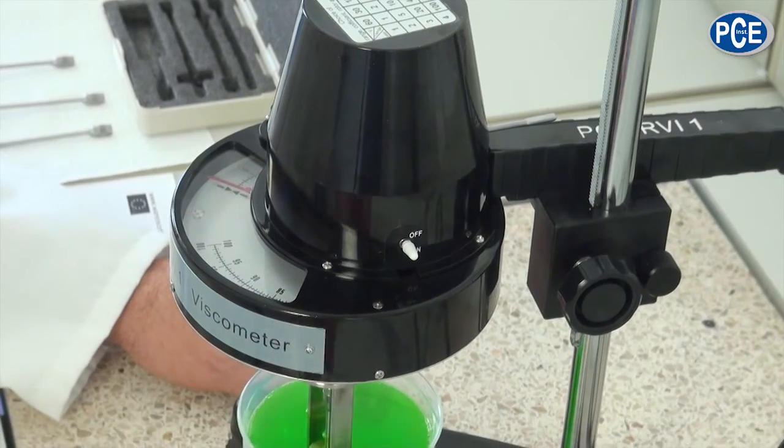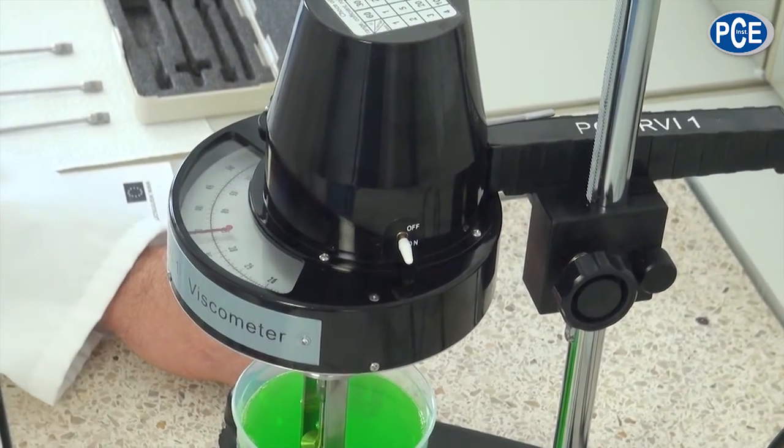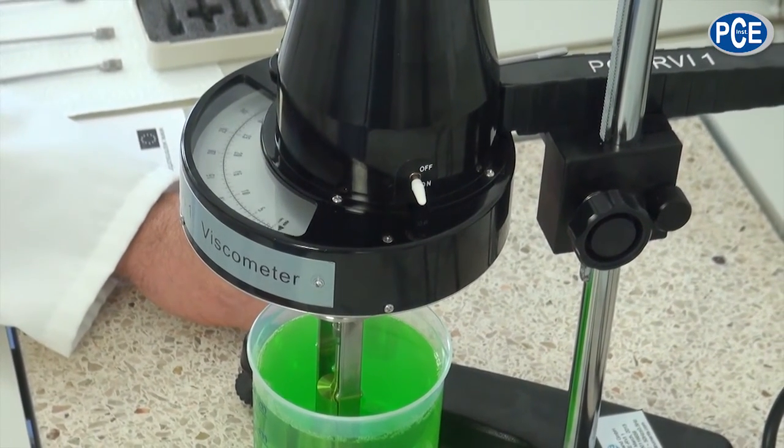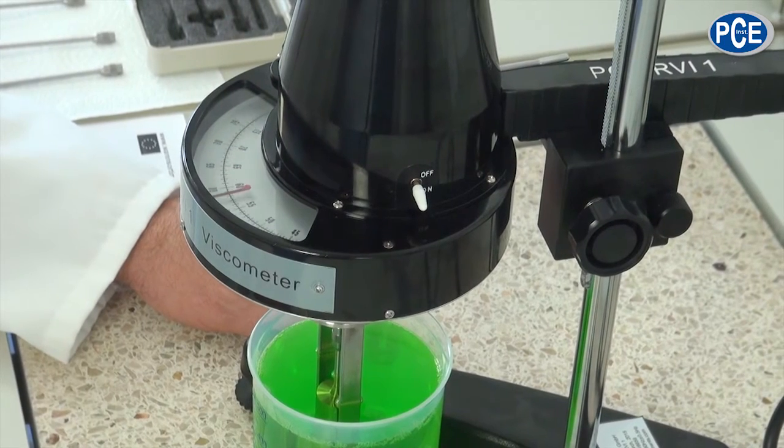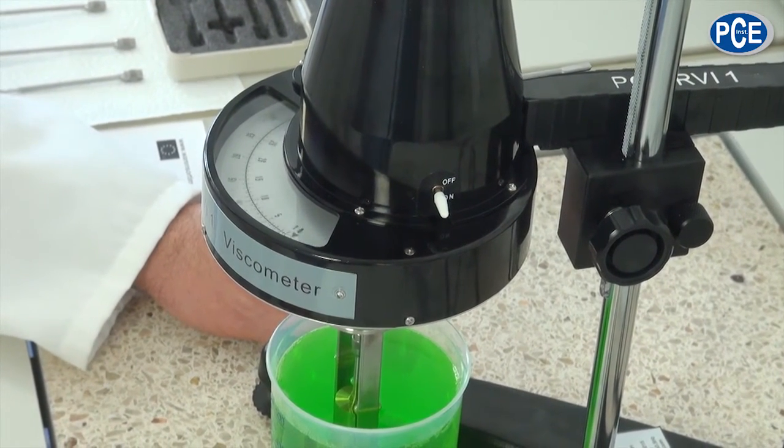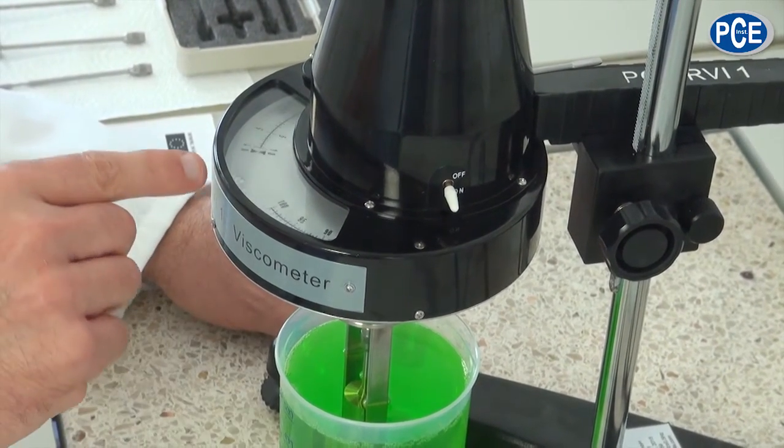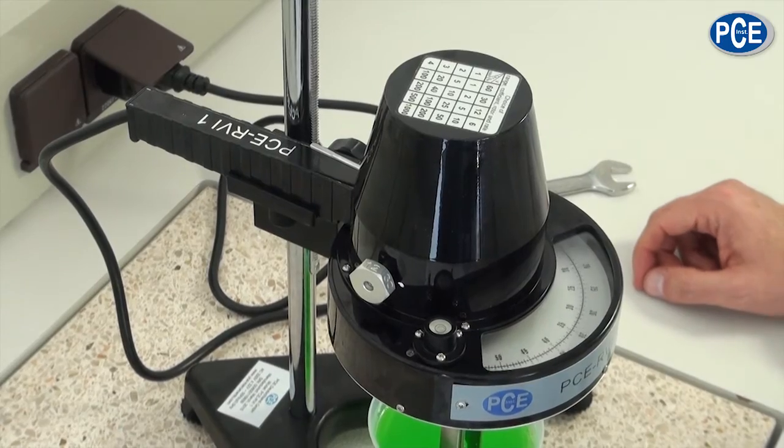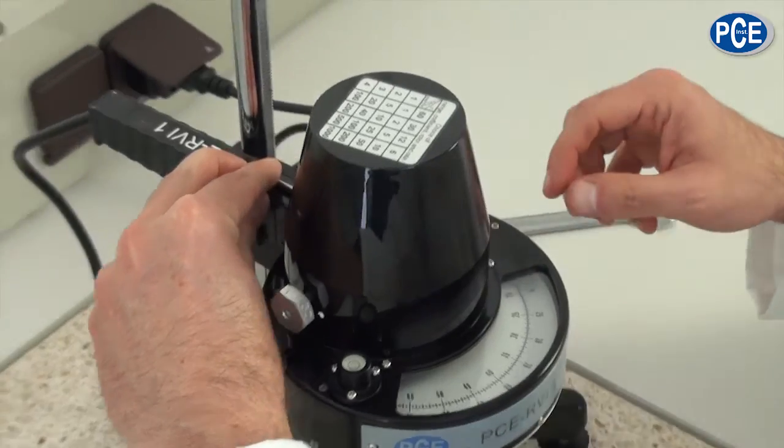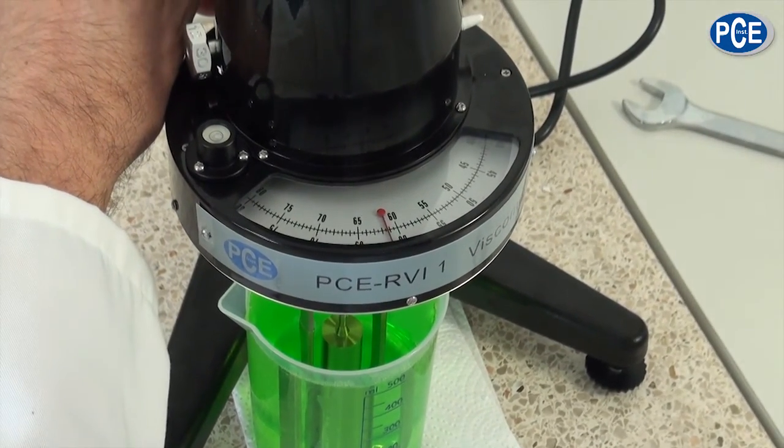We start the measurement by easily turning the on-off switch. And the rotation body starts to measure. We wait until a constant rotation is there. The rotation body has reached a constant and we can now read the viscosity on the scale. To read more clearly the fixing switch is used. And the viscometer is turned off. And now the result can be read.